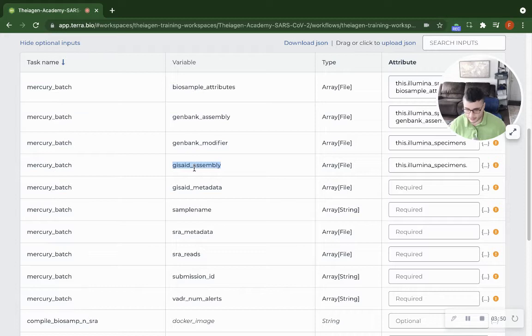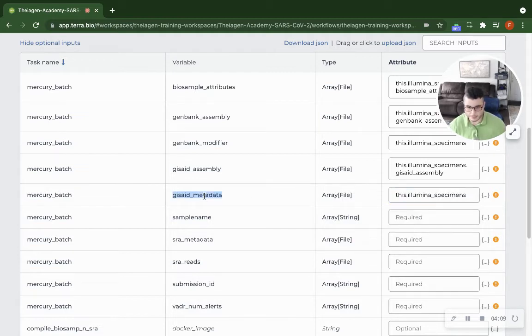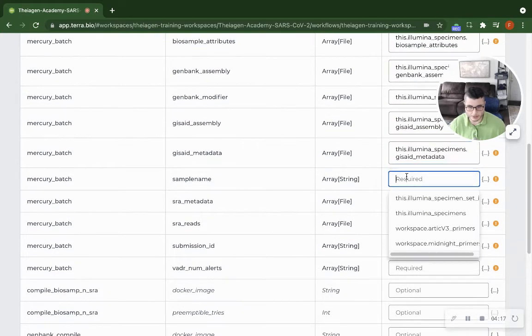It will allow us to concatenate all of the metadata files so that you are submitting one metadata file for a set of samples rather than having to manually process all of those files, or write your own script or run some command line tool to do that for you. So it's a very convenient way to prepare your samples for submission.